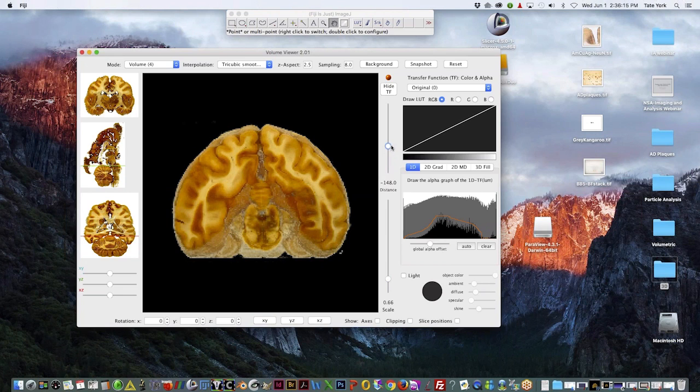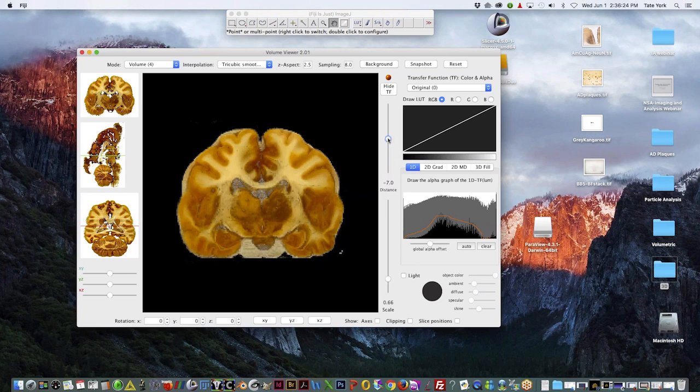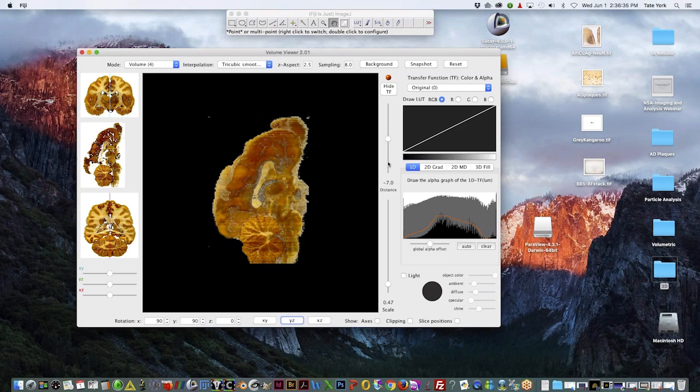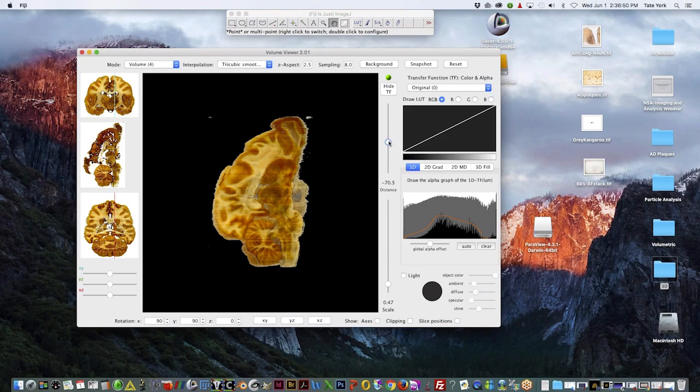And we can also go through horizontally. I know the pixelation can kind of be annoying. It takes it a second to readjust itself, but once it does, the images are definitely well worth viewing. So this is just another handy tool that we utilize when we are working with the block face reconstructions.